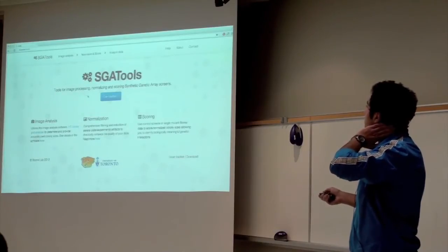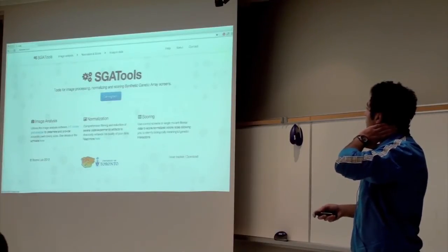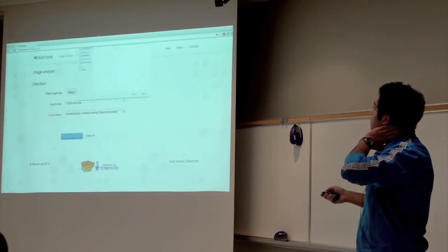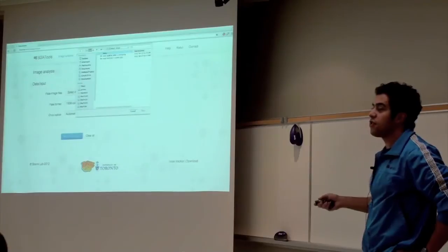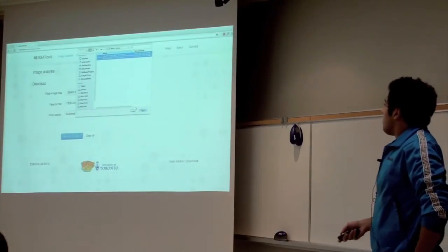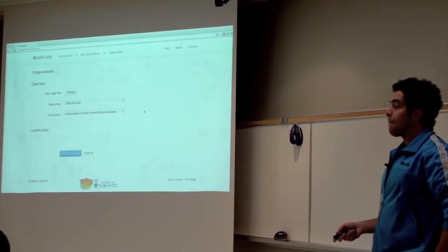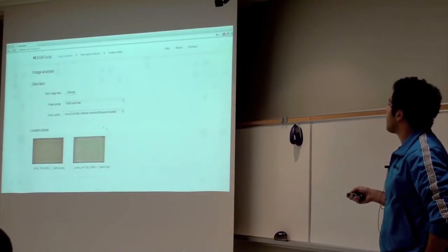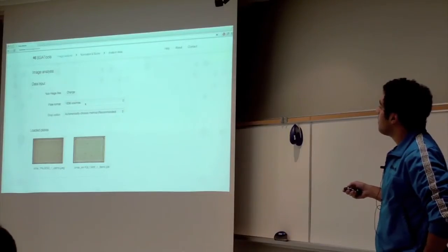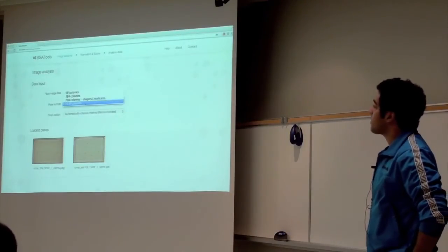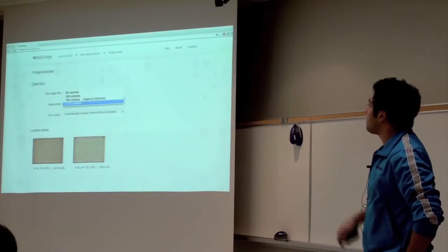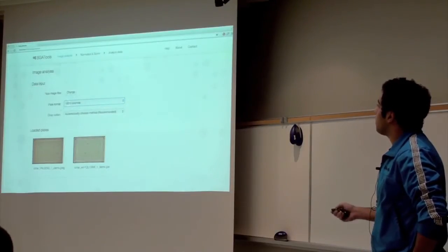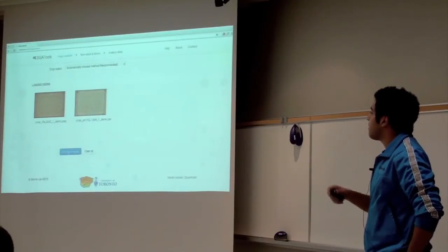This is what we have here. Again, there's image analysis, normalization, and scoring that you can do. So we're going to get started straight away. First page is image analysis, so you can go ahead and select those two images that I just showed you. Once you select these images, they're loaded up here. You can select different formats for the plates that you have. The plate formats that I'm using here is 1536 colonies. You can select different ones, 96, 384, 768. But we're just going to go with 1536 because that's what we have here. Process the images.